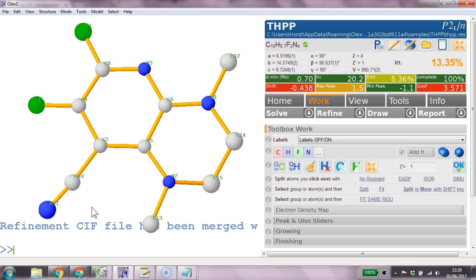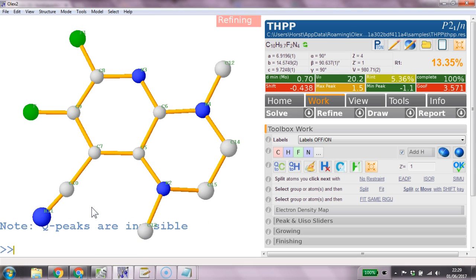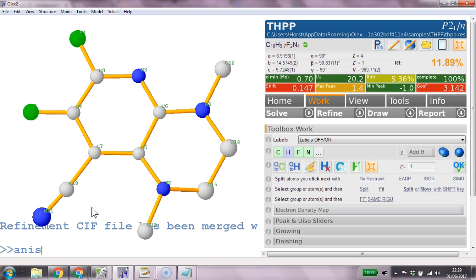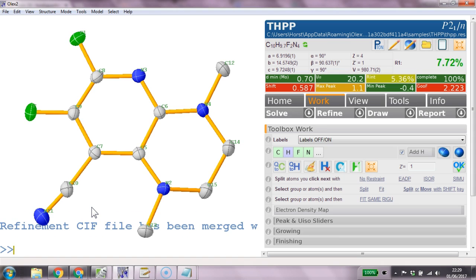Right and refine okay that looks pretty good and we're going anisotropic anis that makes it anisotropic refine that refines it and that looks all together quite good.